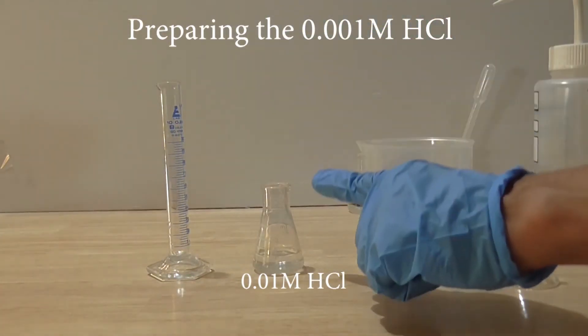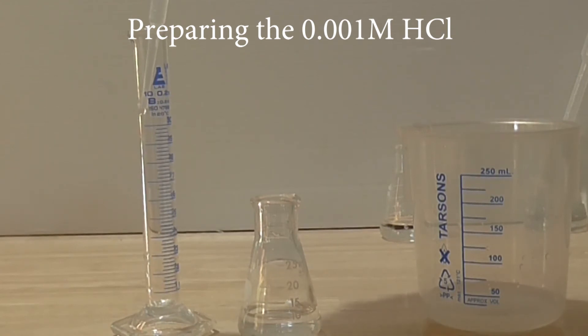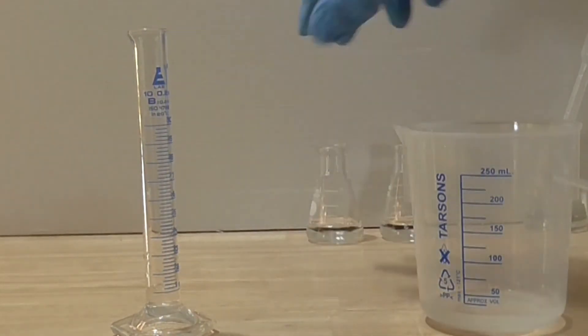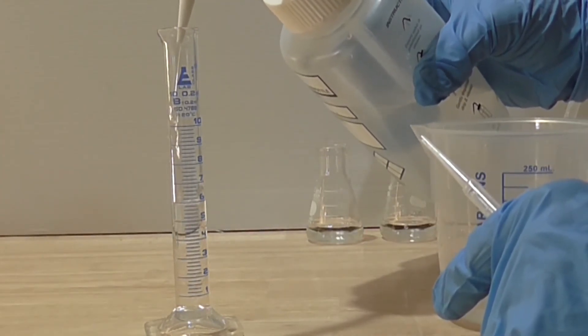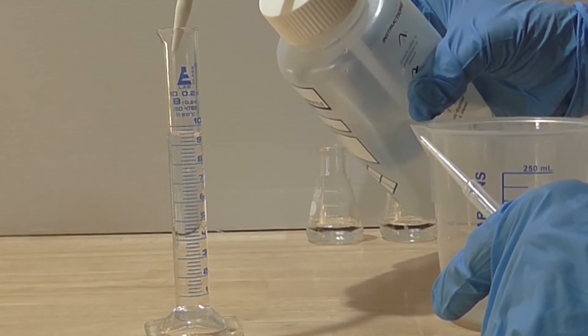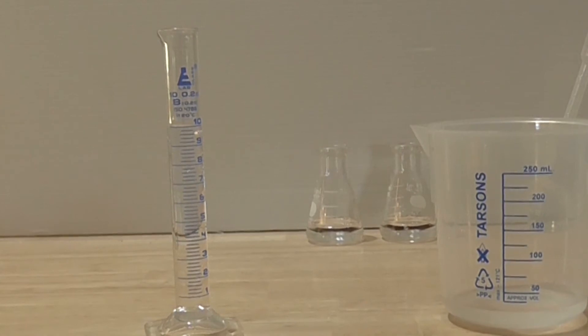Pipette in the standard 1 ml of the 0.01 molar acid into the measuring cylinder. Squirt in 9 ml of distilled water into the cylinder. The total volume of the acid and water is now 10 ml. The dilution factor is 10. Therefore, the concentration of the newly prepared acid is 1 tenth of 0.01 molar, making it 0.001 molar.